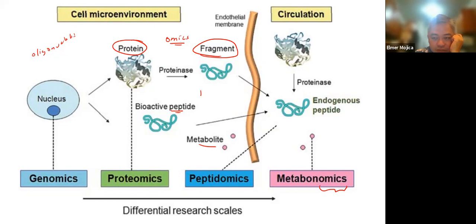Okay, now you can also detect the post-translational modifications throughout the complex biological mixture. You can quantitate either relative or absolute the proteins in a given sample. Pwede ka rin mag-monitor ng enzyme reaction, chemical modification, and chemical digestion. Okay?